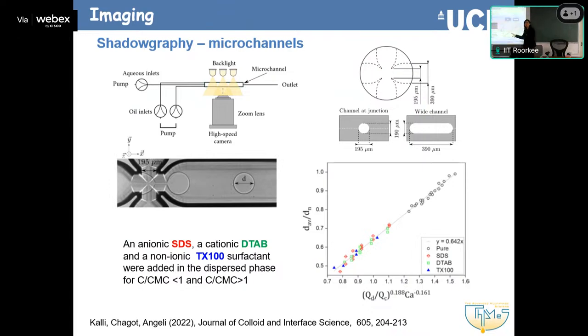What I show you here, we'll talk about drops more tomorrow, but I just want to show you that by doing this, you can do it even manually, having good images. With simpler software on the computer, you can get the drop size. And then, of course, you can build figures like this. What we have done here is, again, we're working a lot with surfactants. We try to see what the average drop size is if we change the surfactant concentration.